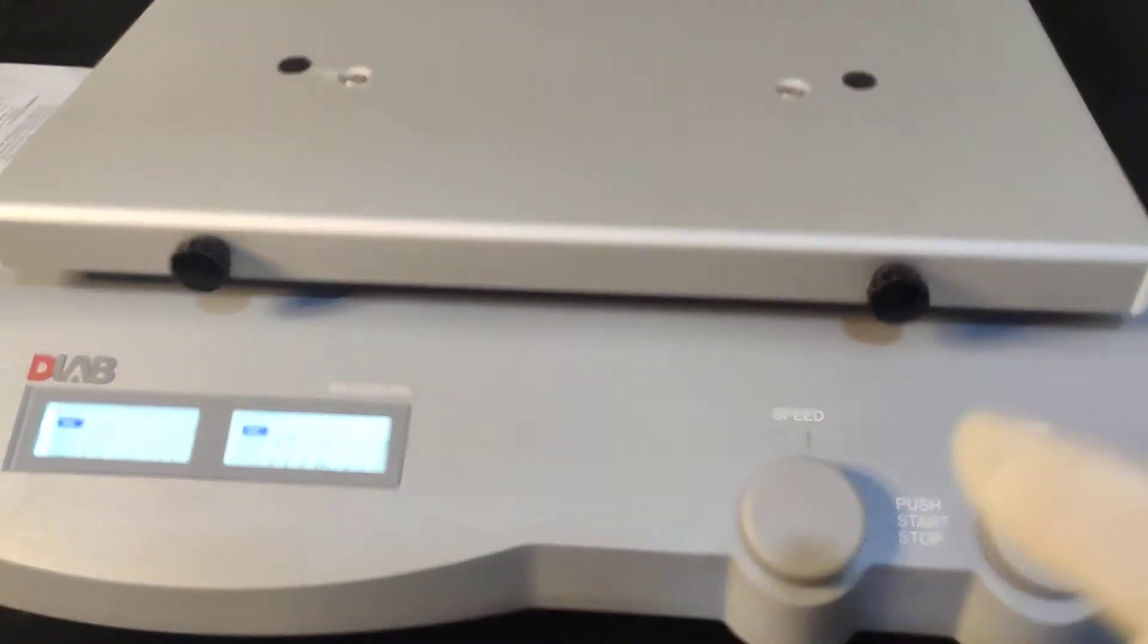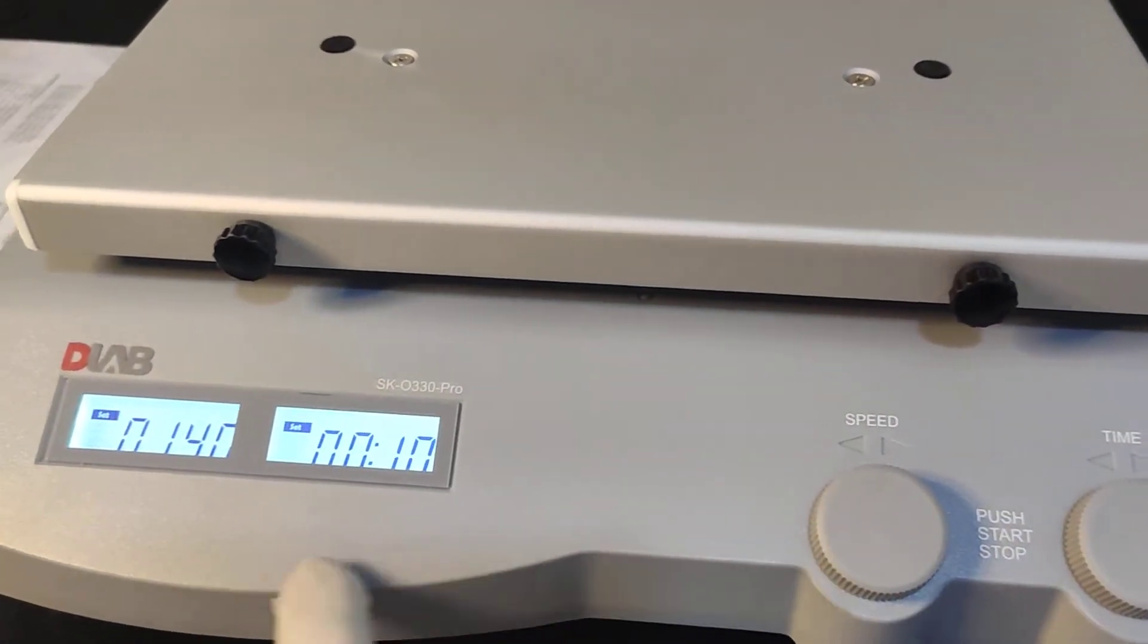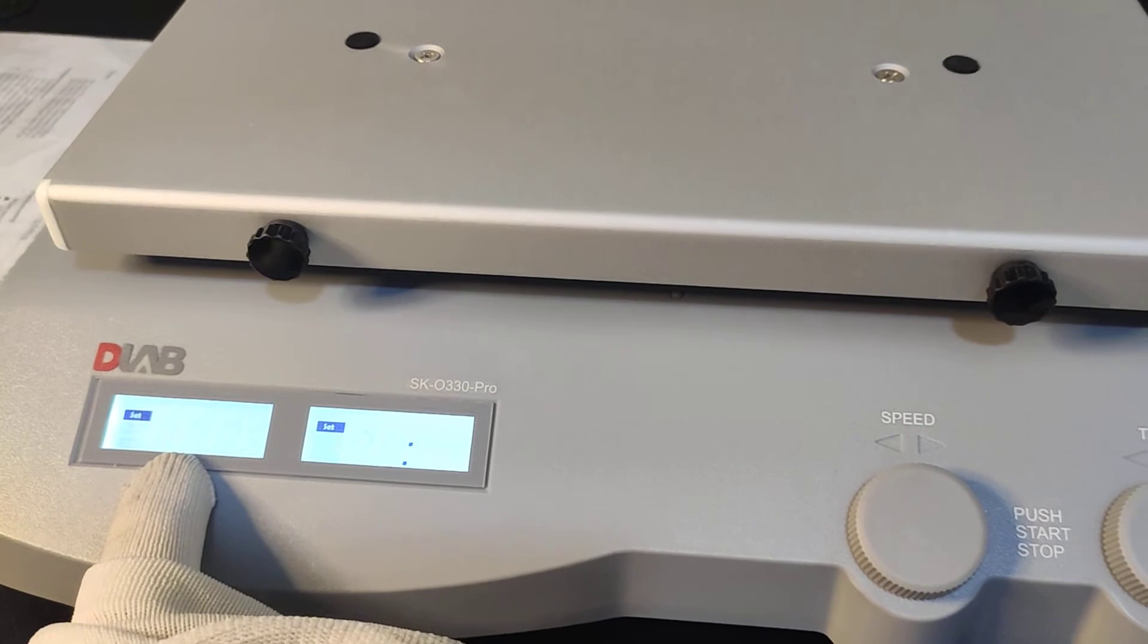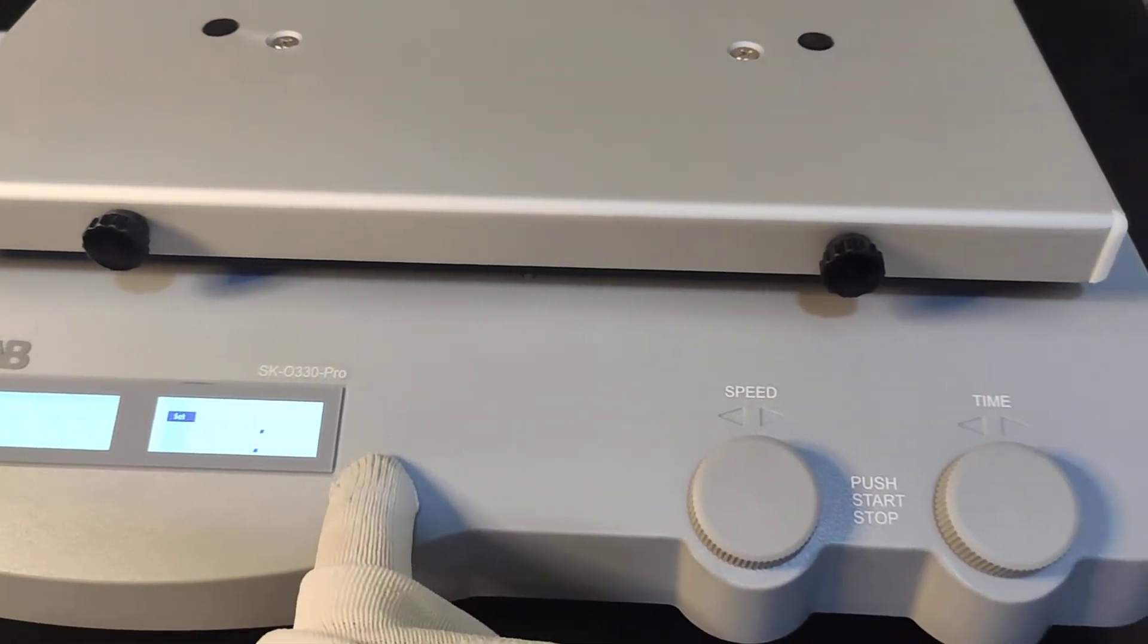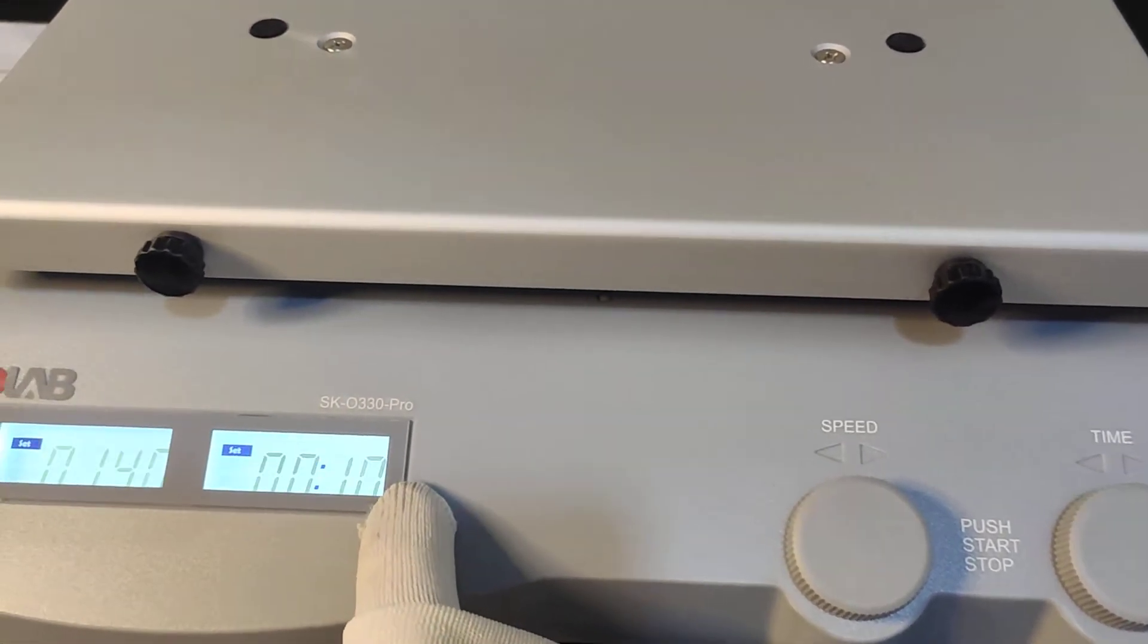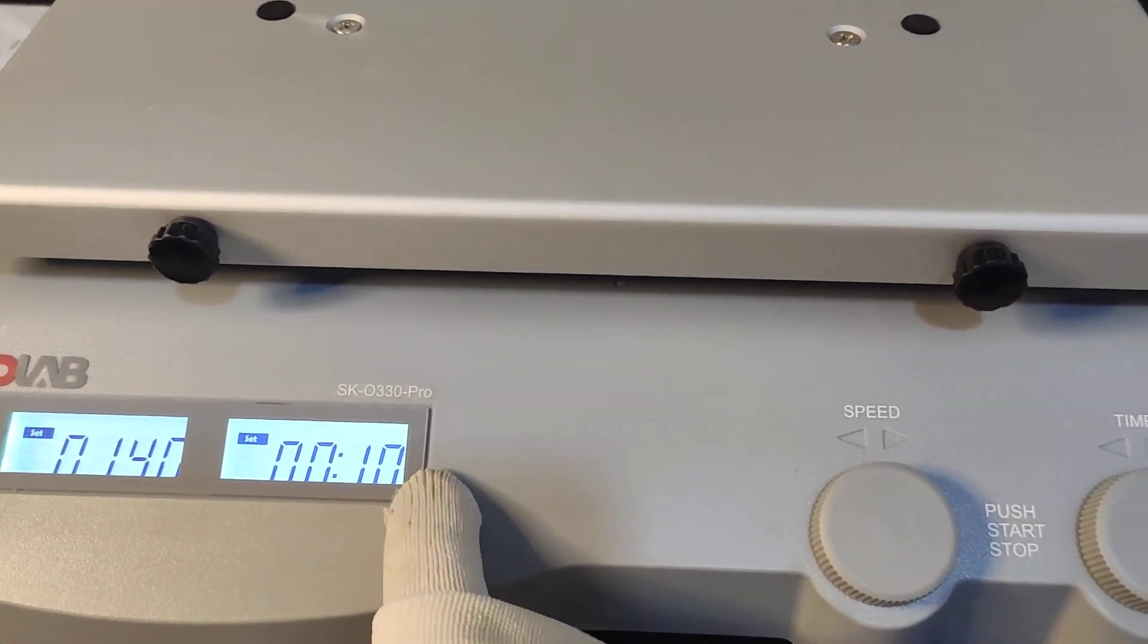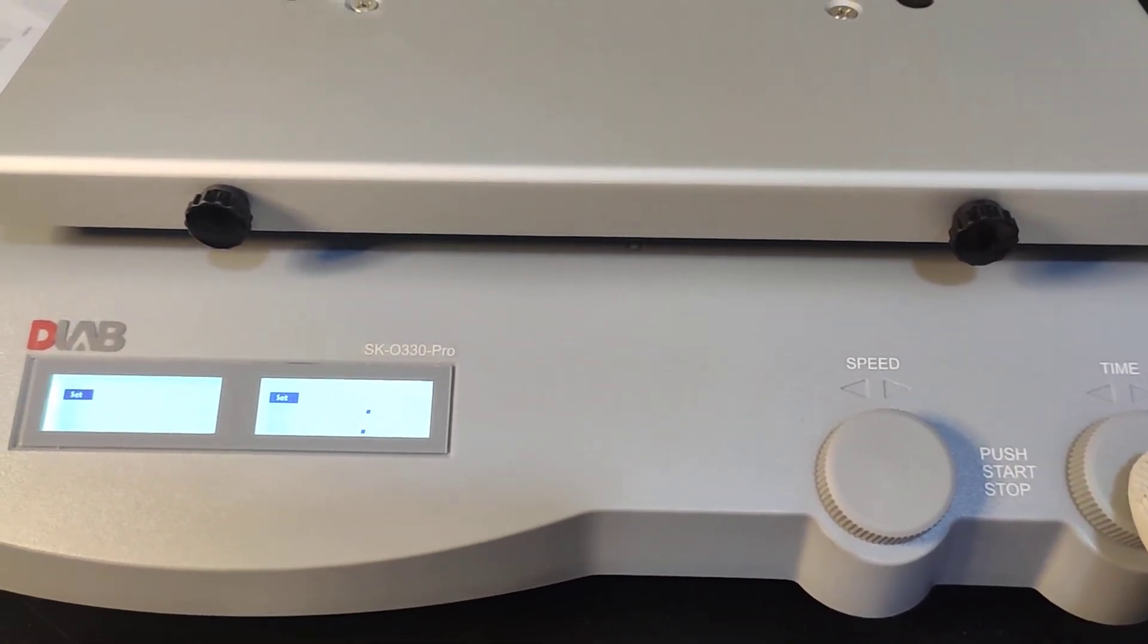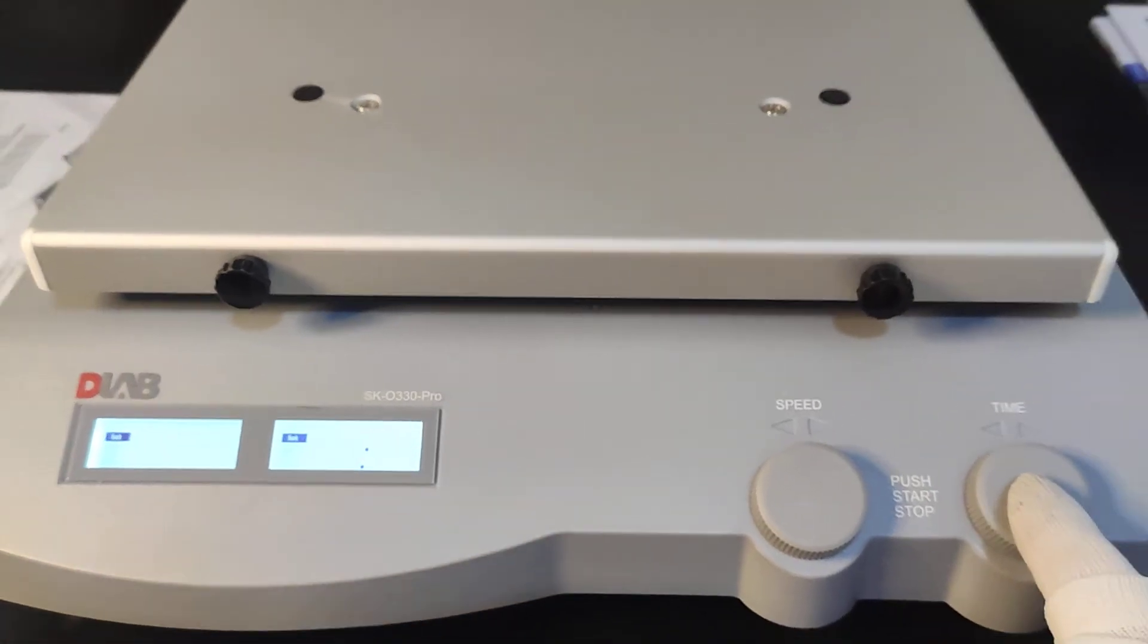So now the speed is 140. The time is 10. We can let it start.